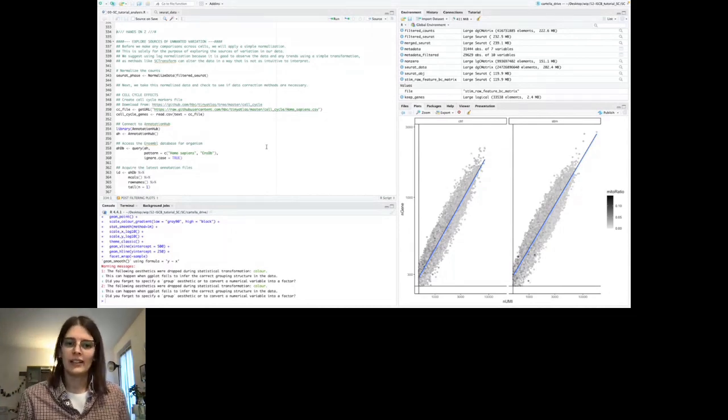So we have now the second part of the hands-on, where we will perform all the steps that we saw before. So we will check for unwanted variation. We will perform PCA calculation. We will choose how many principal components to use for the clustering. We will perform the clustering. We will check the quality controls of our clusters to understand whether our clusters satisfy us or not. And then we also end up assigning cell types based on the expression profile of each cluster.